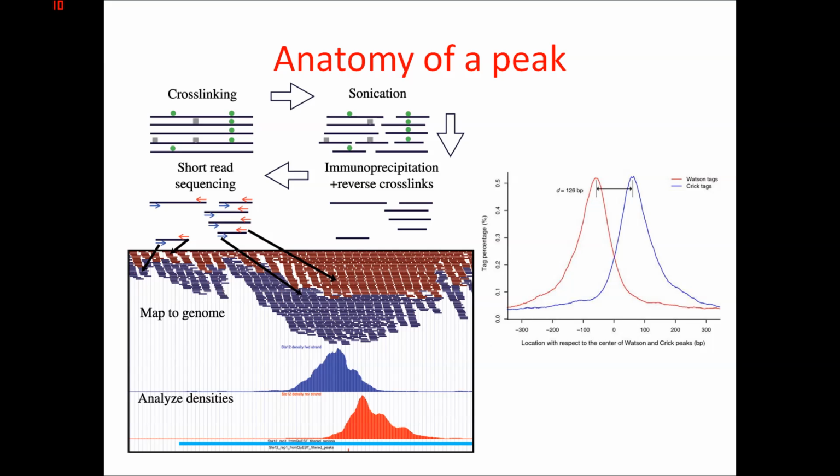Now additionally, if you have a read, say for example this one, and say this goes from position 100,000 to 100,036, there can only be one read in that position on each strand, so 2 reads in a particular position. There are exceptions to this, but I'm just going to keep this simple at the moment.